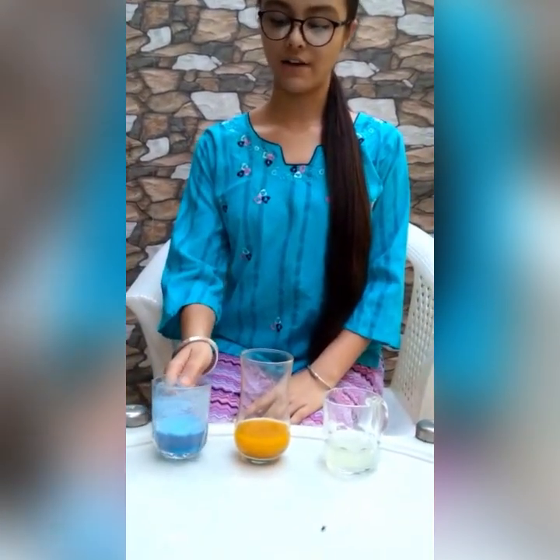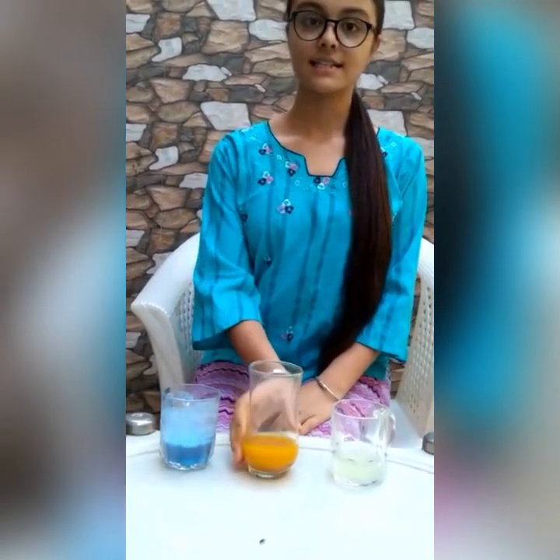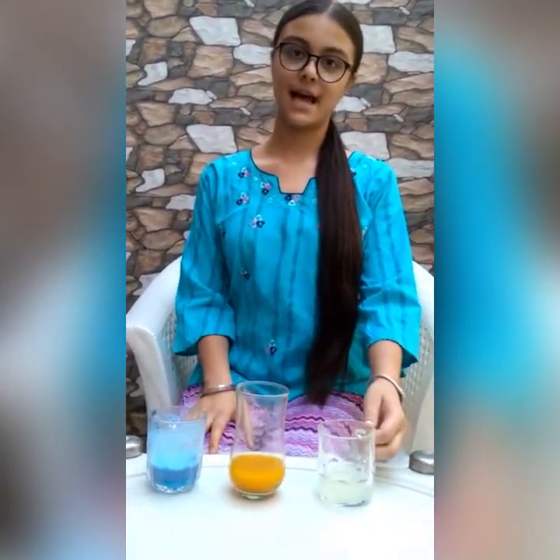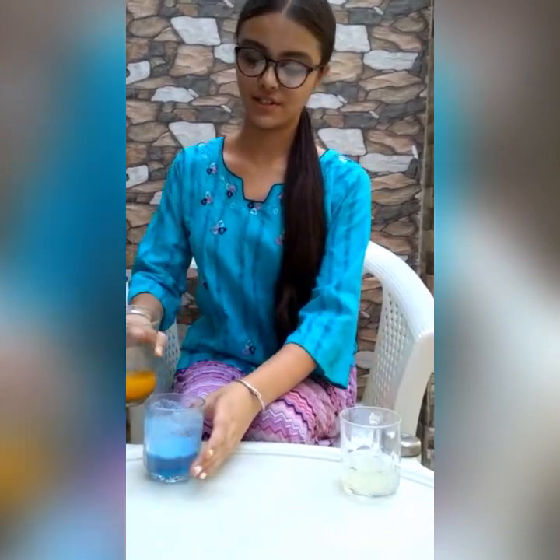Here I have some detergent diluted in water, some turmeric diluted in water, and lemon diluted in water. Now I am going to add this turmeric solution into this detergent solution.